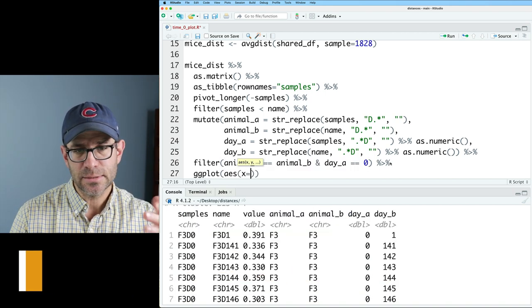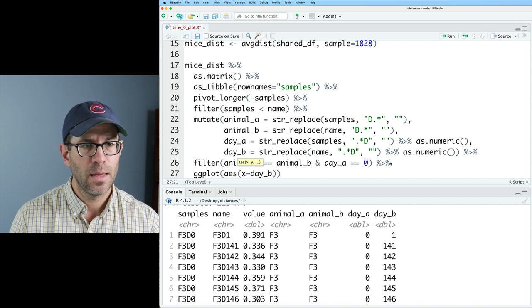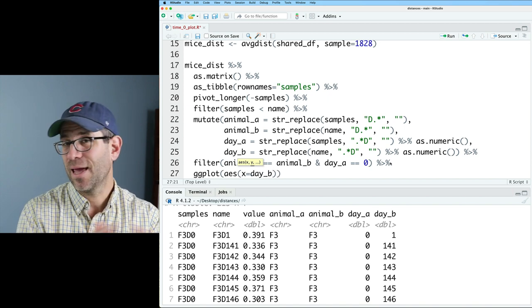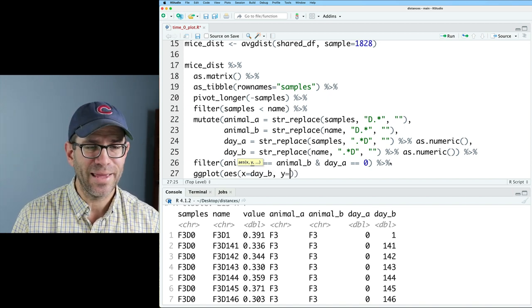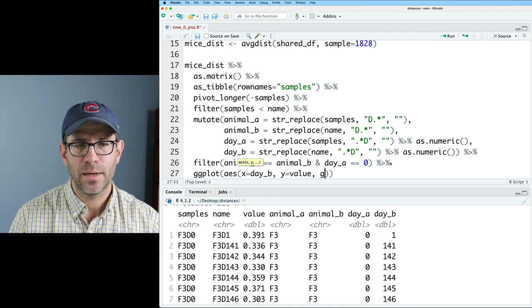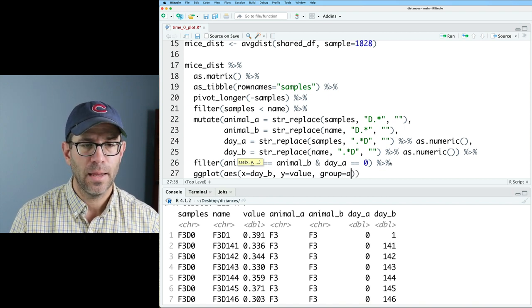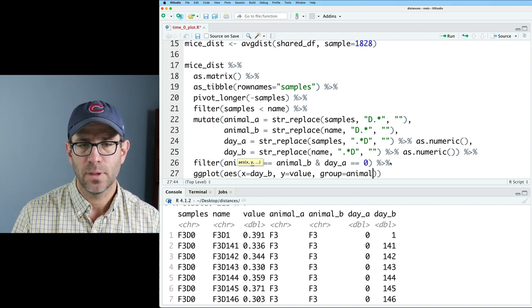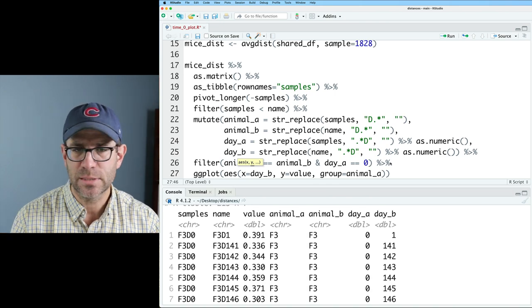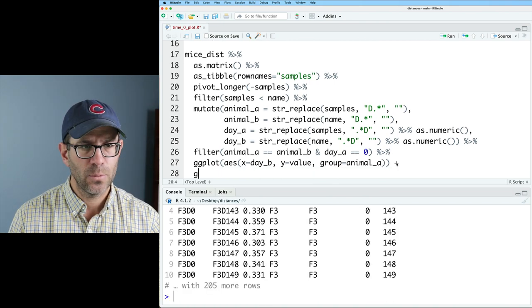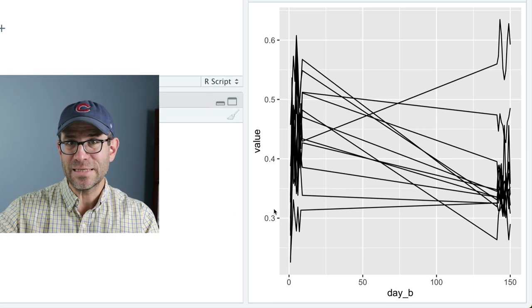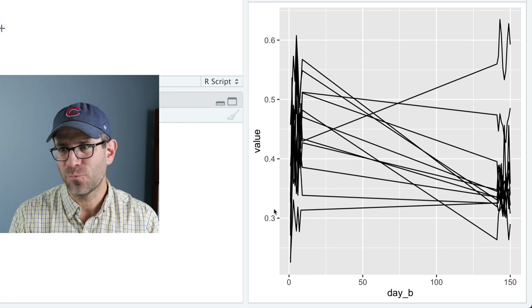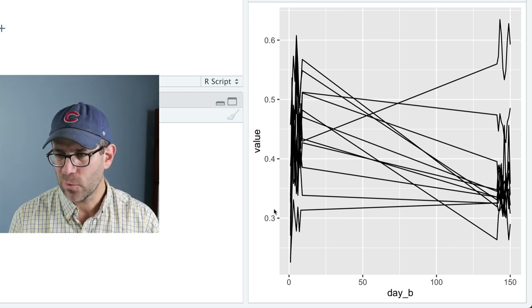AES, x, I'm going to put day b, because day a is zero for everyone. And then y is a value. And we'll go ahead and group by animal a. Again, animal a and animal b are the same value in our data frame. And then we'll add geom line. We get these two clusters of points for the early and the late time points.